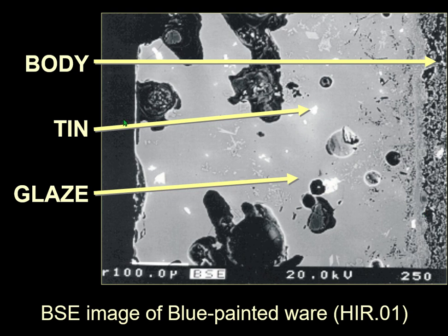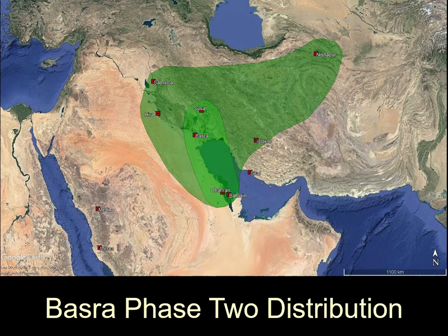So now they've added more tin, so there's tin all over the glaze, but still you can see that there are other silicate crystals growing, there are other inclusions, and so this is still a continuation of the pre-Islamic alkali glaze technology, but with more tin in it. So it's like the next phase, which really works with the phasing, of course.